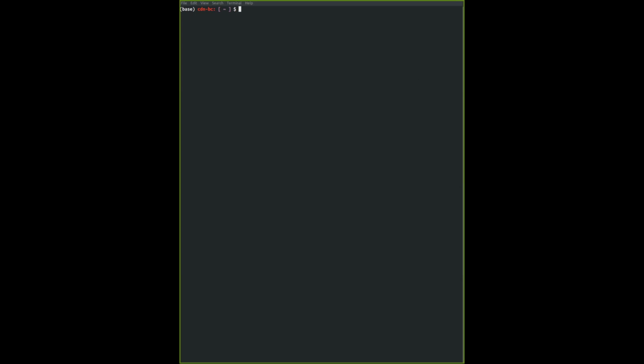Okay, so your terminal might look a bit different from mine. But generally, you have several pieces of information, such as the current user of the terminal. You also have this very weird sign, it's called tilde, and this basically tells you the current directory that you're in.